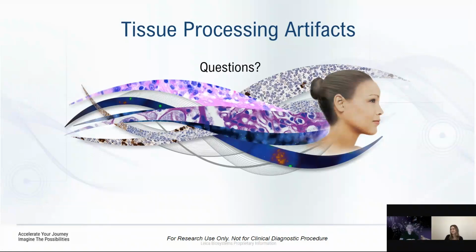Paraffin has a long shelf life, but it does have an expiration date. So if you have paraffin that has maybe not been kept in the laboratory, maybe subjected to high heats, or if it has been sitting around for a while, it does have an expiration date. So those could be factors that would cause the crumbling of the paraffin in your block when you're embedding.